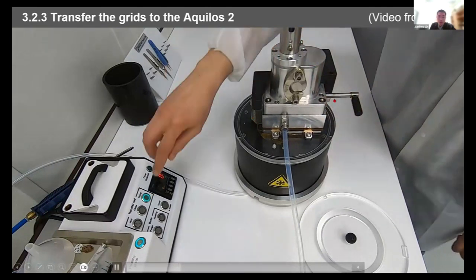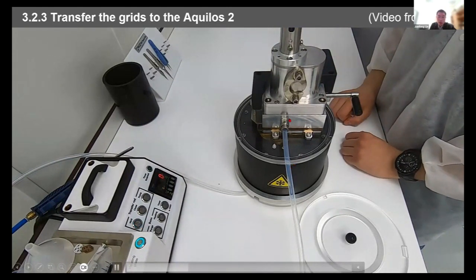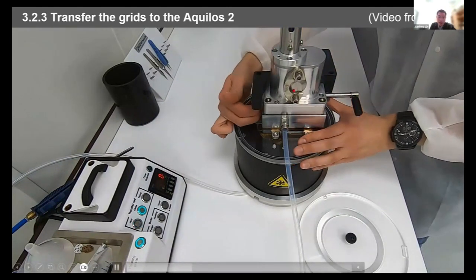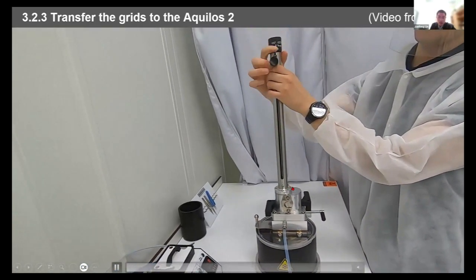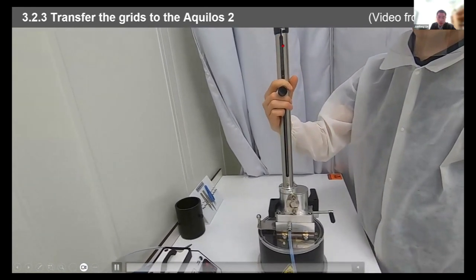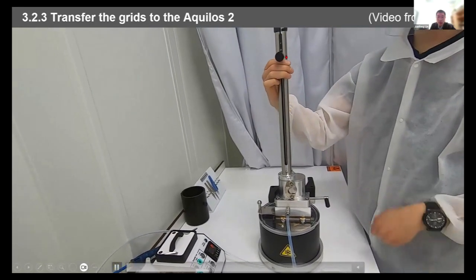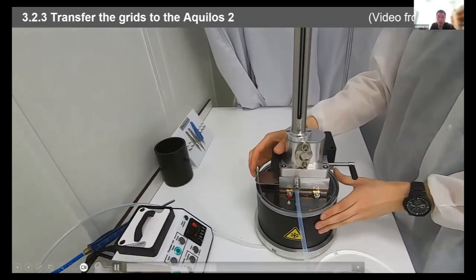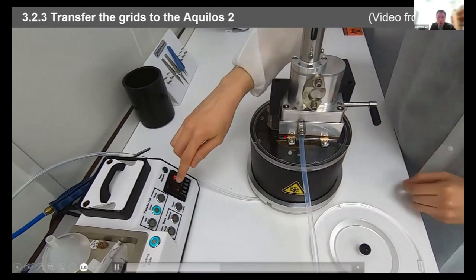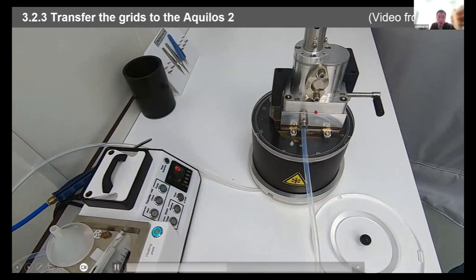And open this valve, and when you vent, the dry nitrogen gas will fill up the chamber. And then you can lower down the transfer rod to pick up your shuttle, pick it up and secure it in the top. And then close the valve at the bottom, and then pump the chamber in the bottom part for around 15 seconds.